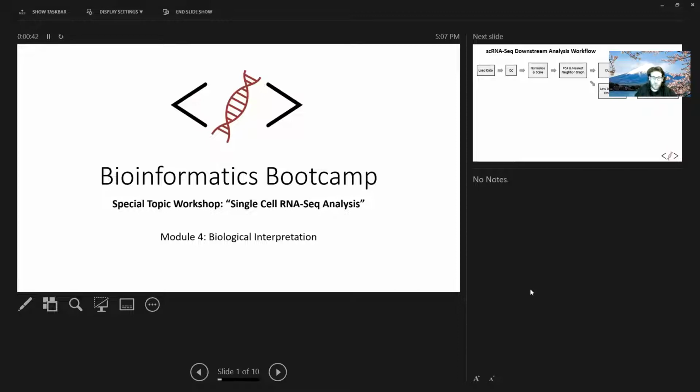sequencing. So before we jump into all of the actual biological interpretation part, I'm joined by Wes, who has volunteered to show off an alternative to the scRNA pipeline that he actually uses. So with that, Wes, you wanna go ahead?